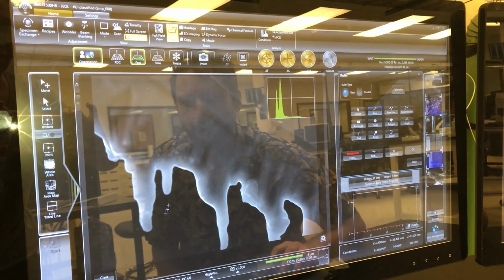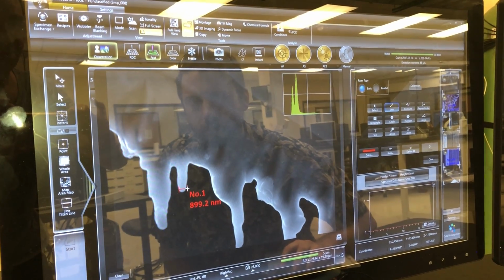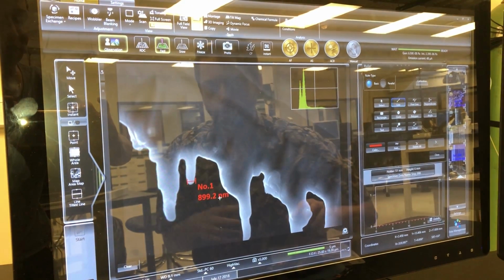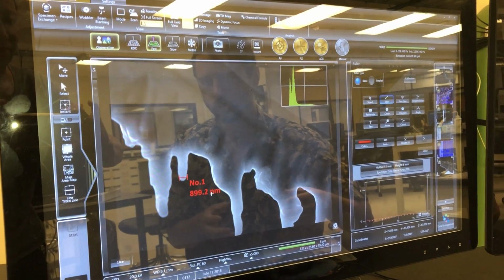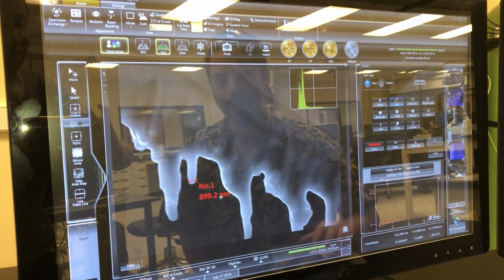and ask how wide is the little tip of this blade. And it's just under 1 micrometer wide. So this is going to be maybe about 5,000 atoms across, this little tip. And that's almost a better number to go by when we're looking at so small of a thing as how many atoms are in it rather than how many times am I magnified.